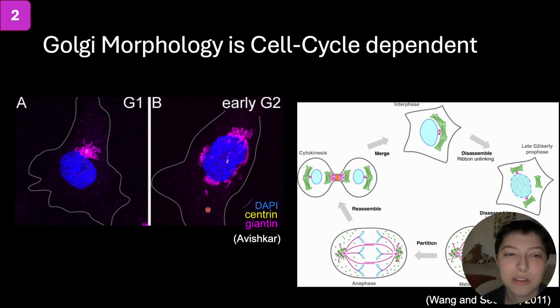This is something very specific to the Kaverina lab that I rotated in. They discovered this, and no one knows why, so that's kind of exciting. I should have mentioned that cargo just means proteins in vesicles going down the microtubule. And so I want to measure if the protein transport to the Golgi differs between this compact state and this extended state.